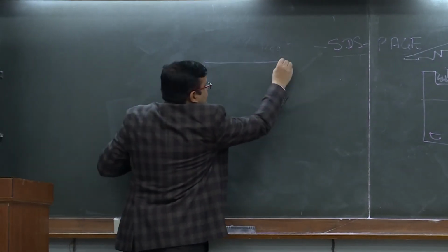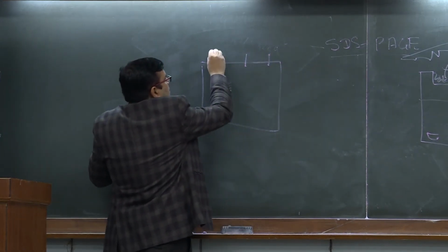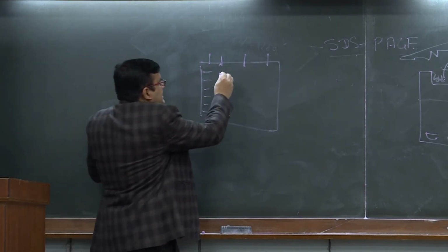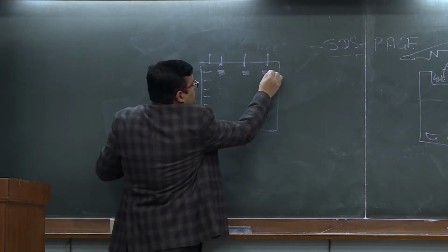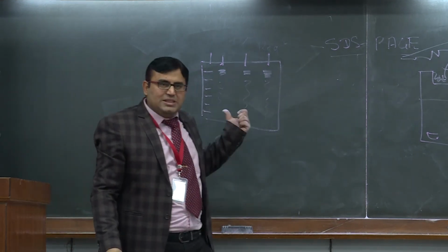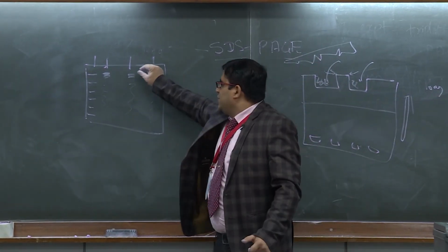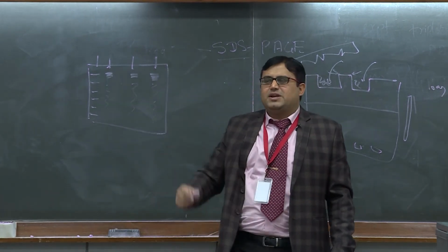Now this is my SDS Page gel. These are the lanes. The first is basically for the marker, right? Now in this lane I am getting protein like this. Now you have to tell me what may be the condition, what happens to this gel. Initially we got certain bands, but then all the rest are little bit faint proteins.